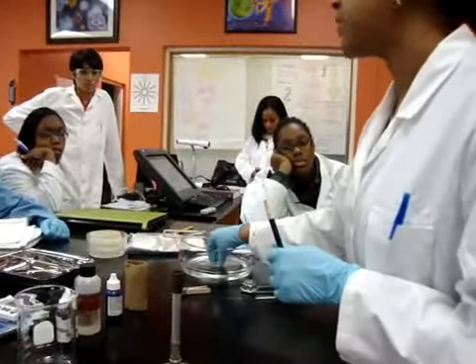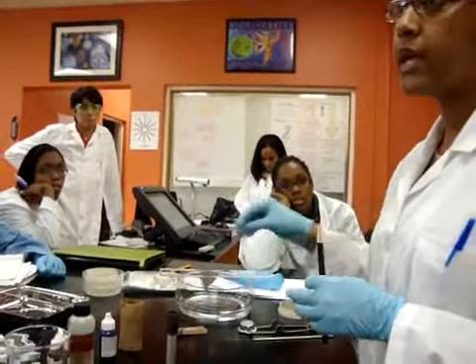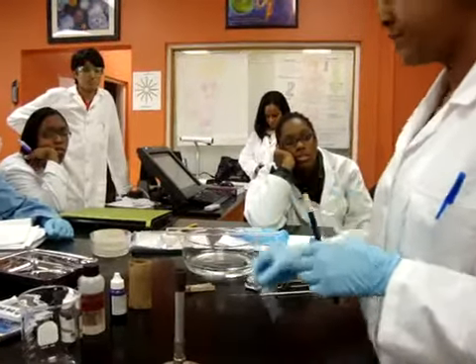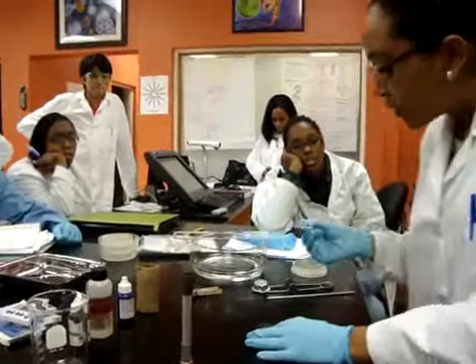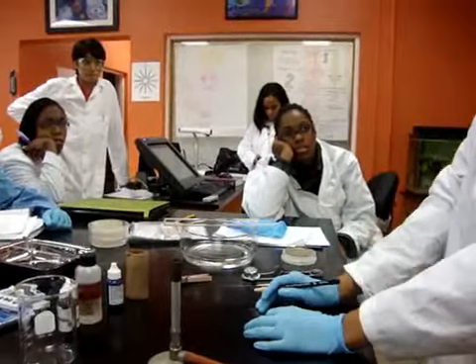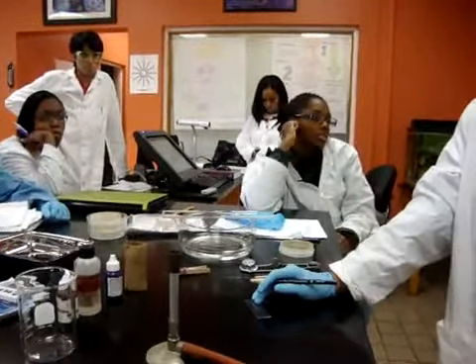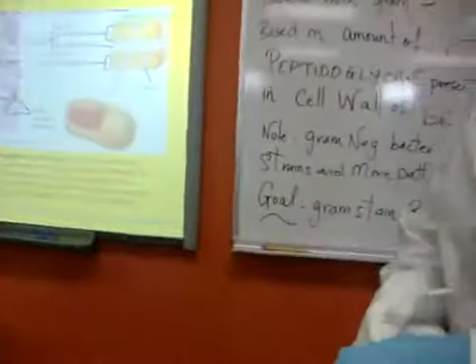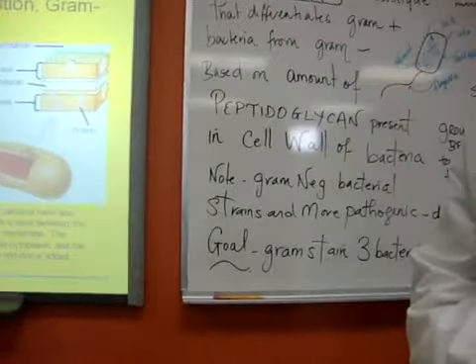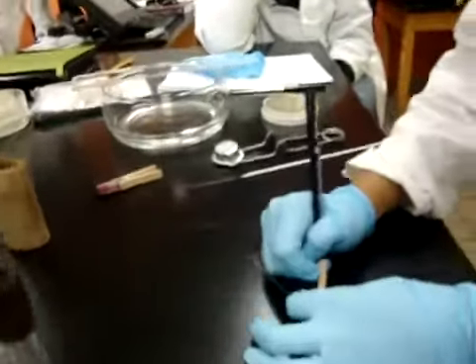We're going to use wax pencils instead of markers because we're using ethanol to rinse our slides, and ethanol will take the marker off the slide. So you want to label your slide with whatever bacteria you're going to do. Usually we just put the first initial of the first name and then the second name. I think I took out Staph epidermidis, so I'm going to put SE in one corner so that I know that this is staph.